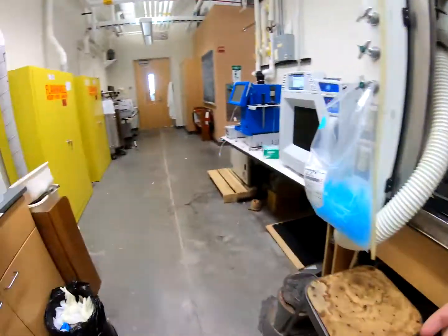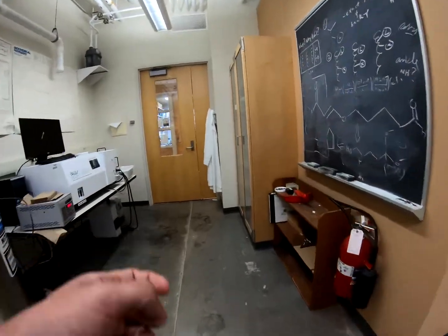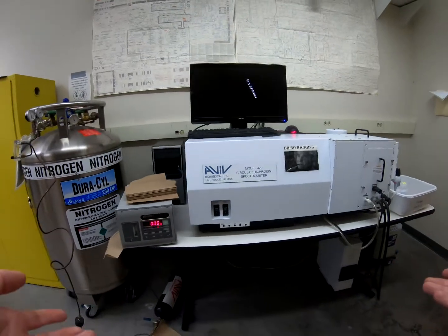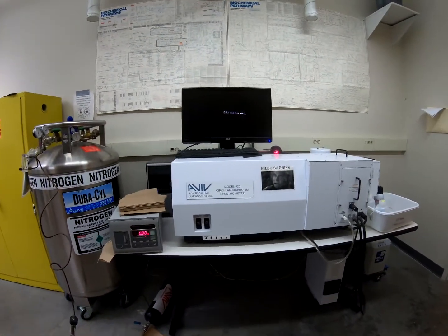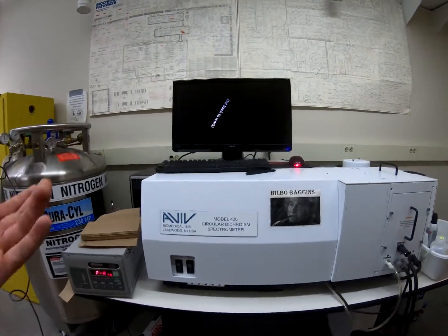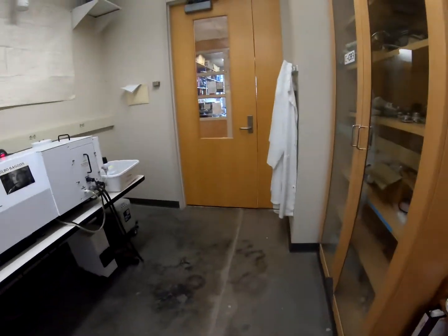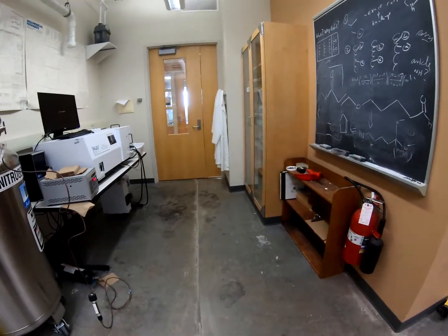The last stop we're going to talk about as we go through Lab C is our circular dichroism spectrometer over here, Bilbo Baggins, which we use to assess chirality in some of our peptides and helicity in other peptides. So that's about all I've got for Lab C. I'll see you guys again in our last module, Lab D.